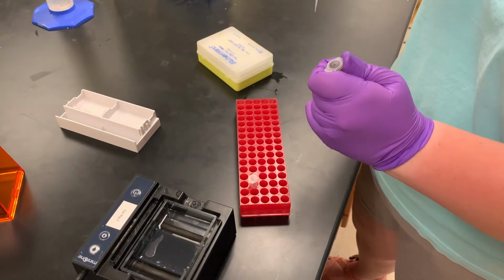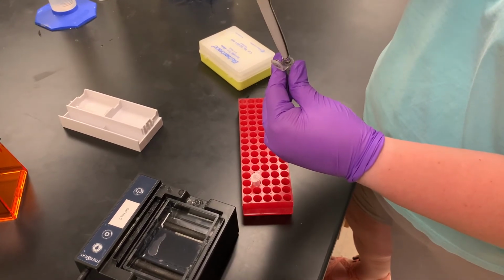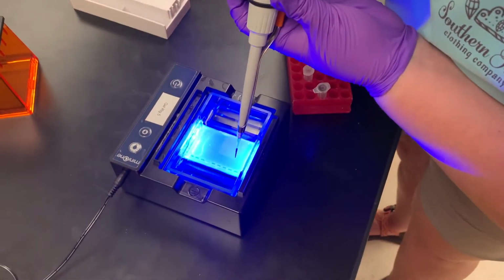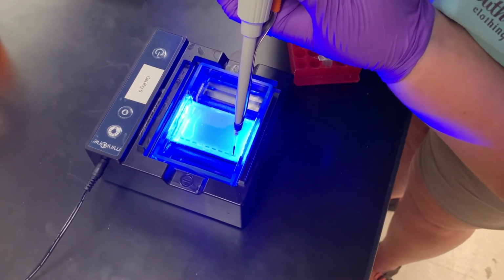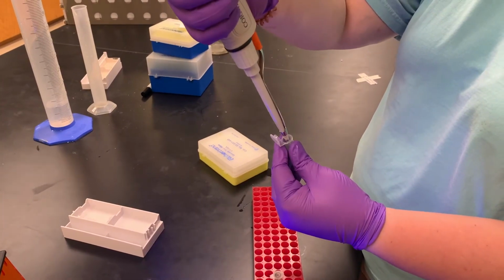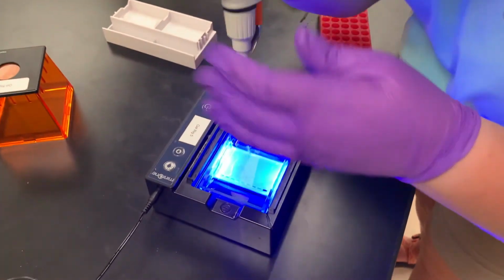Add 5 microliters of DNA ladder to the first well of the gel, adding 5 microliters of each product into the following wells. Make sure the filled wells are right next to each other and do not leave empty wells between them. Turning the blue light on while doing this can help with visibility.